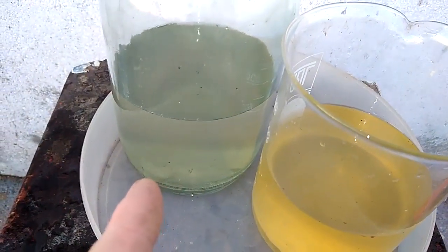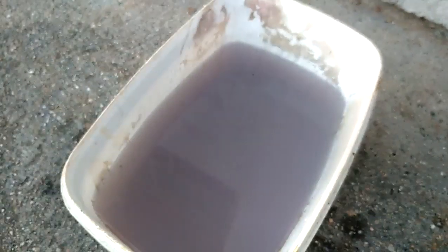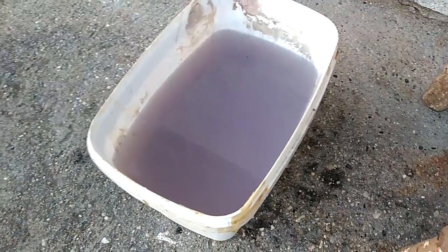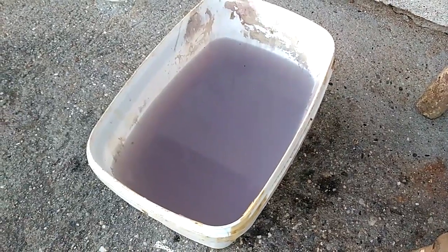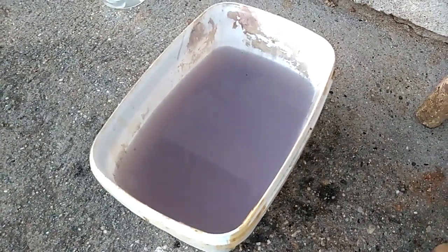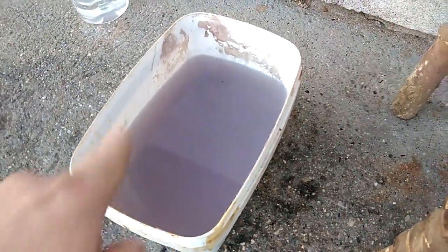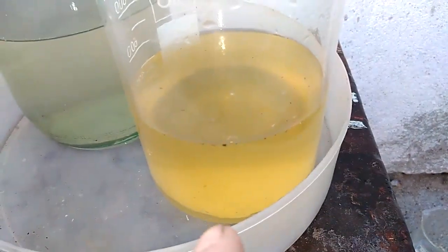This jar has distilled water from the first rinsing, and here in this dish I have tap water. You see this purple color? This is because tap water drops silver in the form of silver chloride in a small amount, and outside the silver chloride gets a purple color. So this is tap water. Here we have distilled water from the first rinsing, and here is our nitric acid solution.